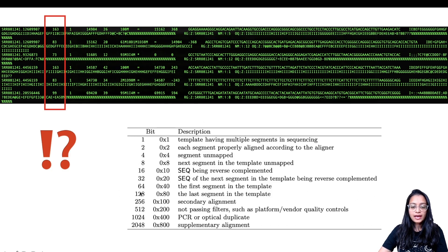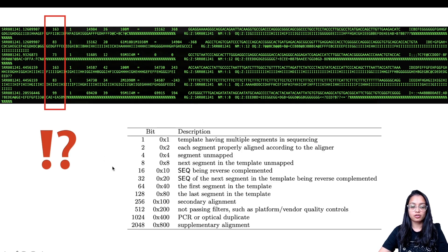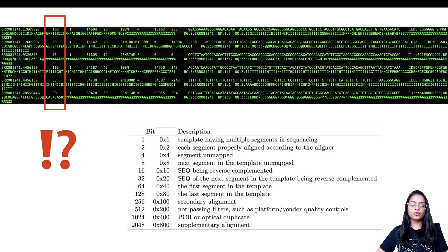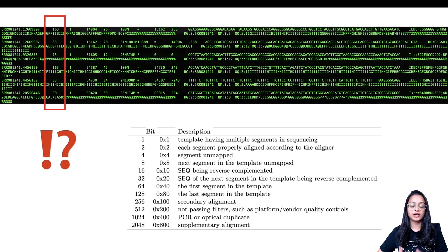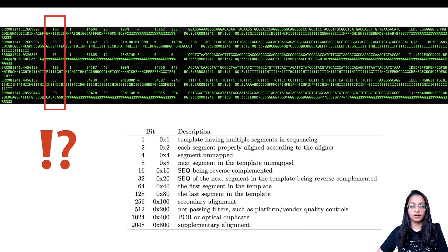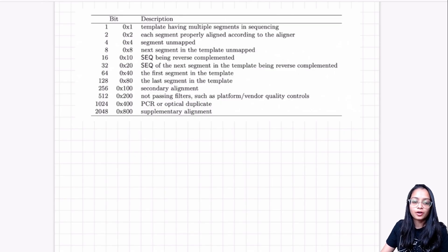As I said, SAM flags can be a combination of multiple values, so 163 is composed of several flags and this read has several features associated with it. Before explaining how to determine those features, you might ask: why do we even need to understand SAM flags? If you want to extract or subset reads that are unmapped, or reads that are PCR duplicates, knowing SAM flags lets you do that directly from the SAM file.